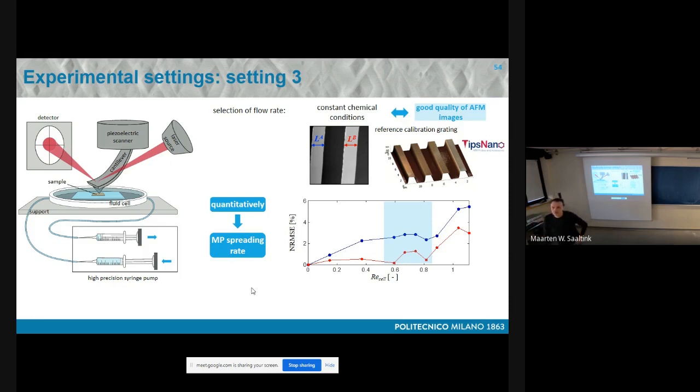Sorry, basic question. Is this mineral sample surrounded by an impermeable boundary, or is dissolution also occurring on the lateral side? No. Well, let's put it like this. The sample is 2 centimeters and something. We focus on 10 micrometers. So of course it is contained. However, it's not too much influenced by that, but of course, yes, it is contained.